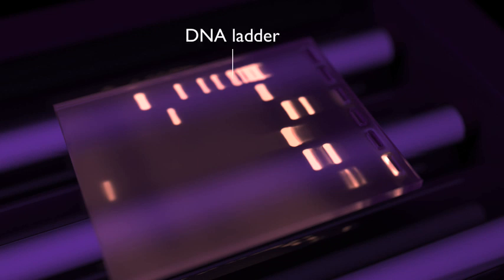The DNA ladder is a mix of DNA fragments of known sizes, which helps determine the sizes of the DNA fragments in the other samples.